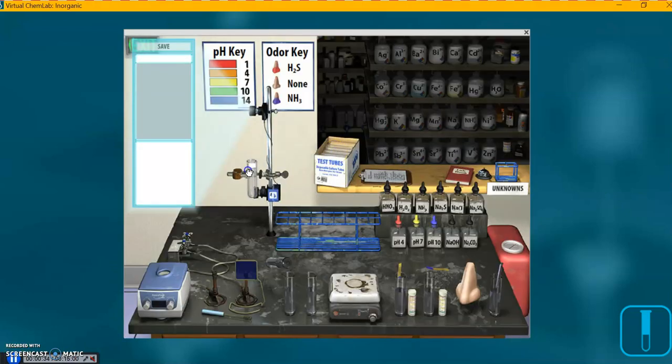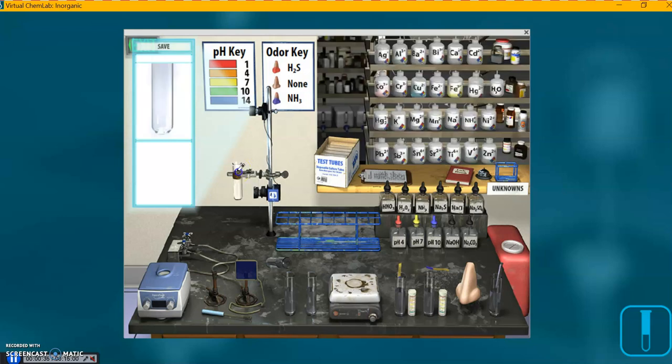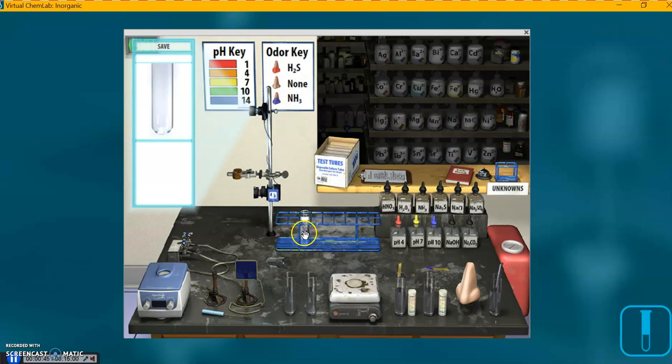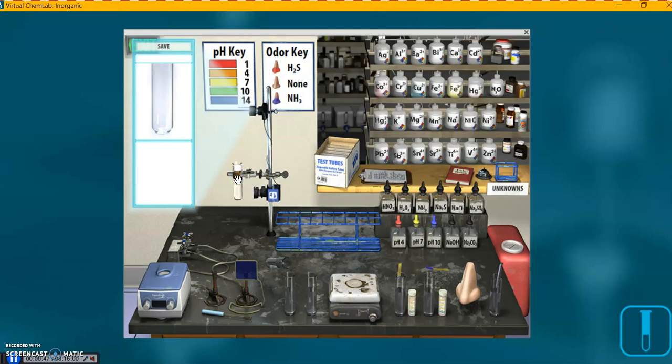I'm going to grab a test tube, put it in the metal test tube stand. Notice everything lights up. If you've done one of these labs before, notice if it's just in the test tube rack, this is dark, these are not active options yet, but in the stand they are.